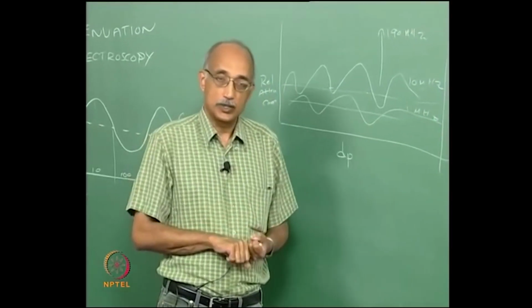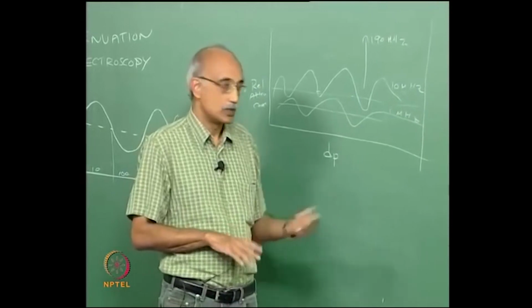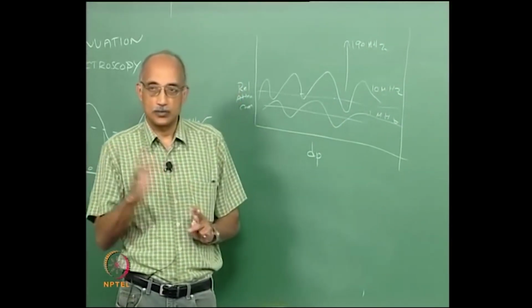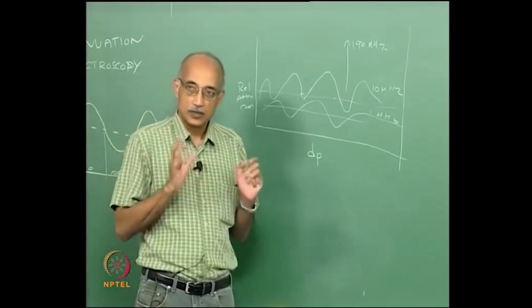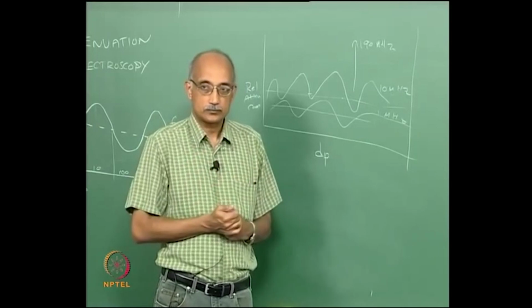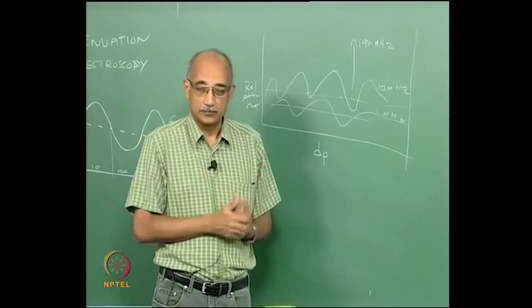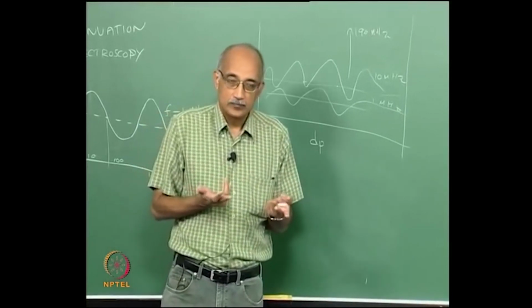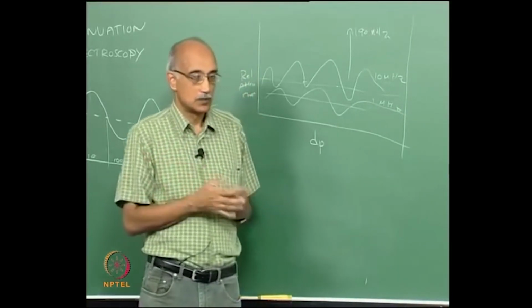Step number two is you actually make the measurements. You irradiate your sample with acoustic frequencies over a wide range, obtain the spectra, and then you compare the two and look for the difference, or the delta. If they do not match exactly, you tweak your model.